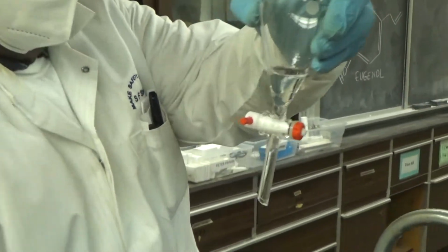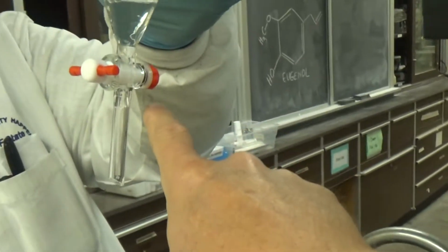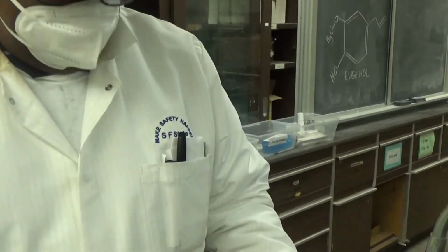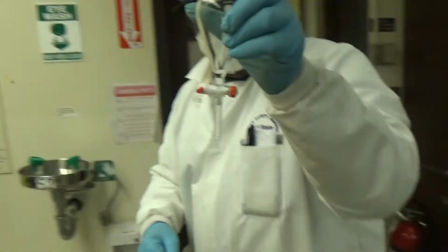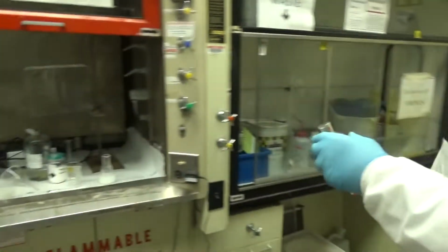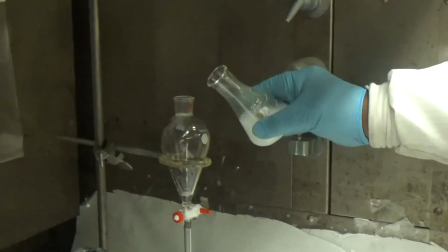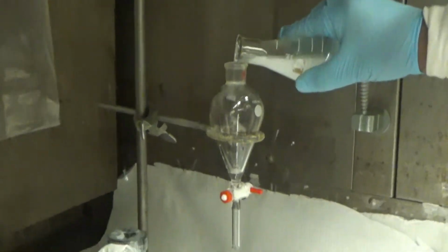And this is the other kind of separatory funnel without the ground glass joint. It's just a little tube at the bottom. In the distillation, you use the ground joint. You take your co-distillate, and you're pouring the co-distillate into the separatory funnel.